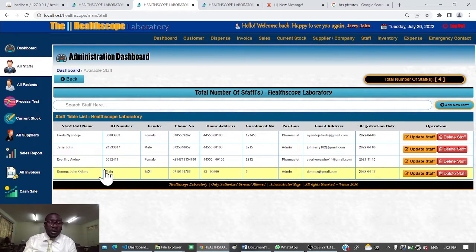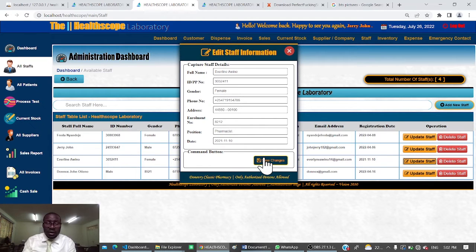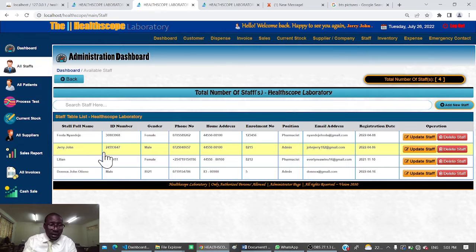You can see everybody's there, but if you need to make a change, for example, maybe you've made a mistake, you can simply come here and then you update by just clicking on that button. Very simple. You can just click on it, and then after that, maybe you change the name. Maybe you can say somebody like Lillian, and then you just click OK. That one is going to change it automatically. So you can see here we have Lillian. Everything has been changed like that.